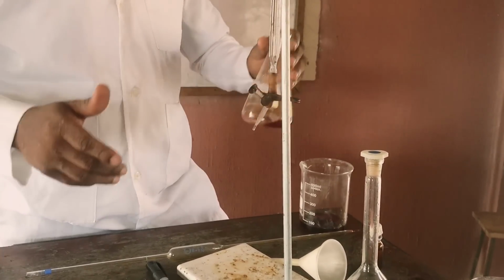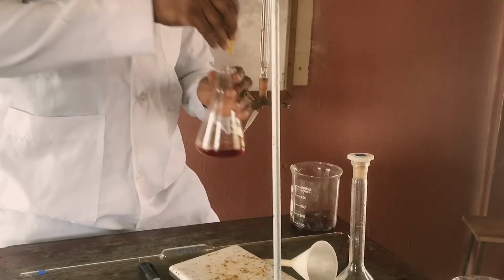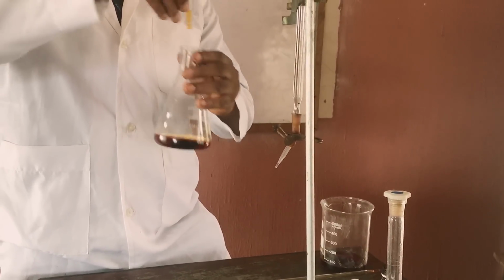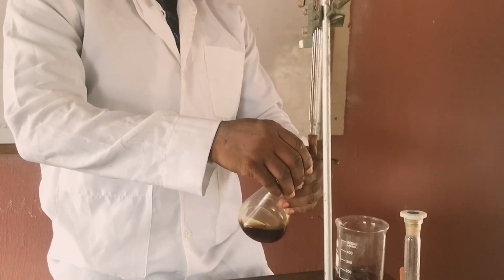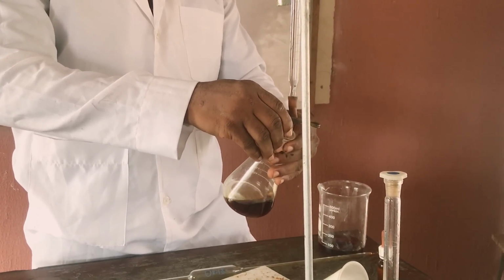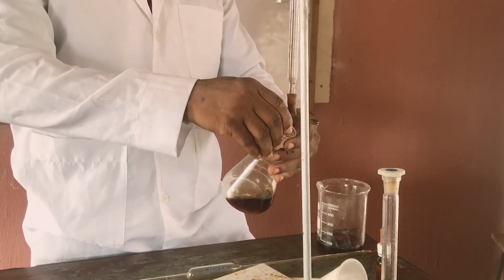See, when I say light yellow, I add my starch indicator, just 2 drops, 1, 2. So you have a blue-black now, and I titrate. Gently, please. Take your time to do it, so that our average titer will be very accurate.